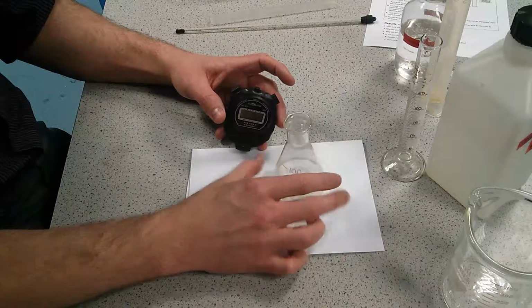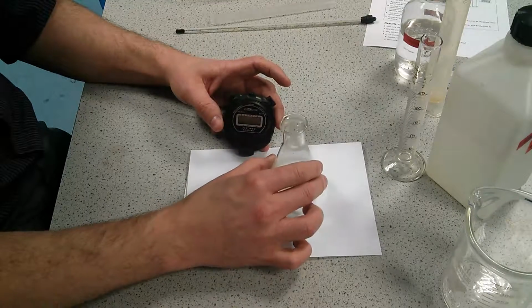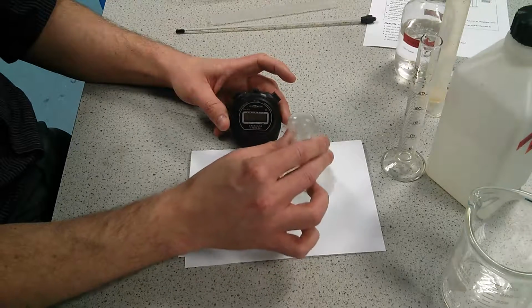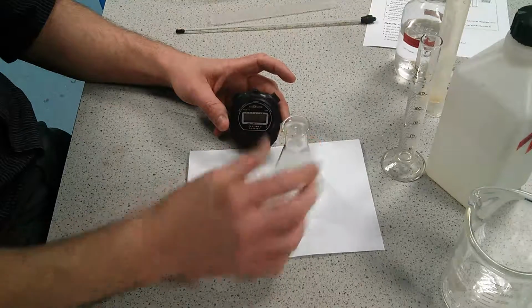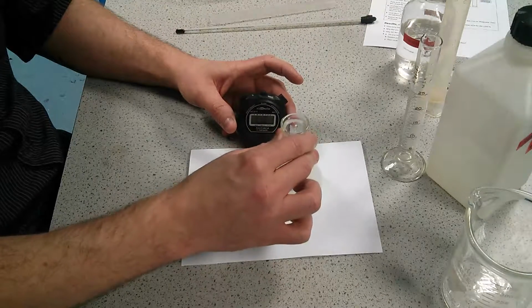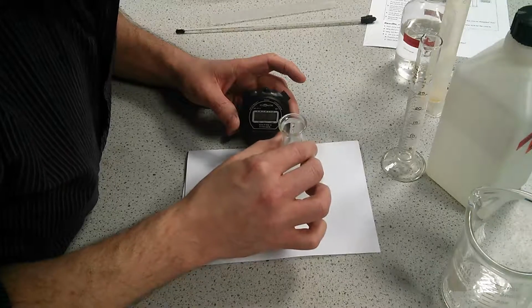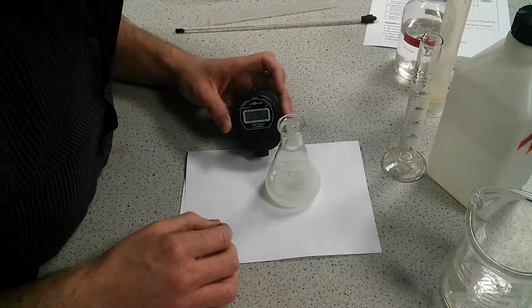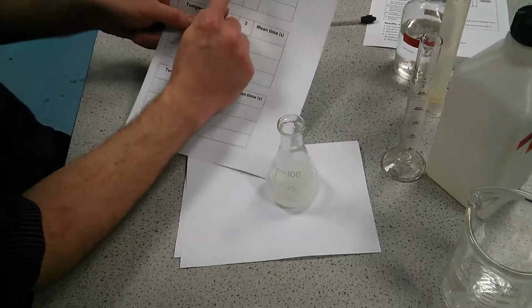So you keep stirring. Keep stirring. And then I'm going to look down the top. Now I can still see the cross. Still see the cross. Still see it. And then I can stop. And then we're going to write down that time in seconds into our table. So we're going to write that there.